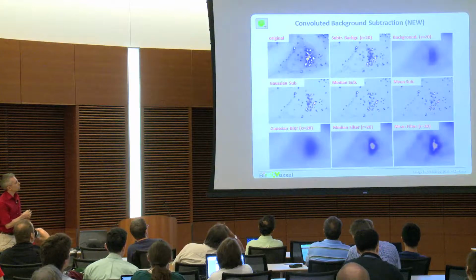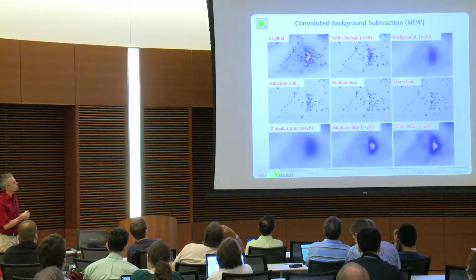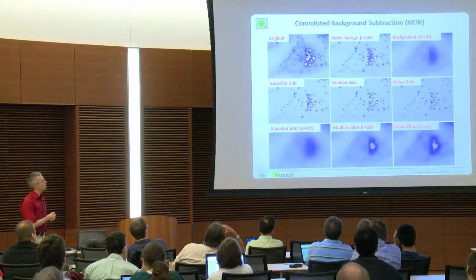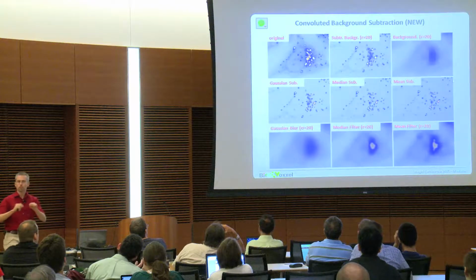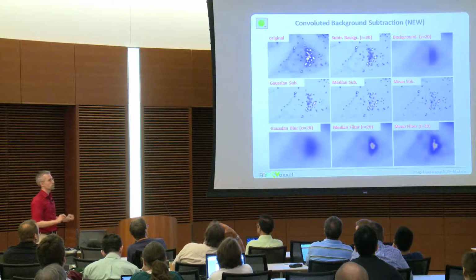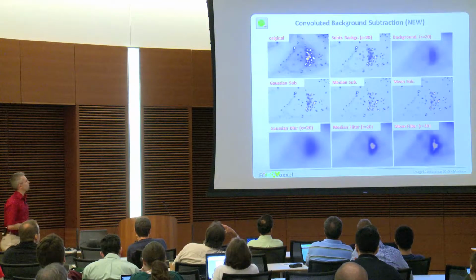If we subtract the background here now with a rolling ball radius of 20, which is based on the size of those features, then you see we can nicely push down the background a little bit. And this is actually how the background image looks, and there you see these edge or block artifacts which occur. That is especially a problem at the borders of images, or for bigger features. So be careful with those kinds of things.